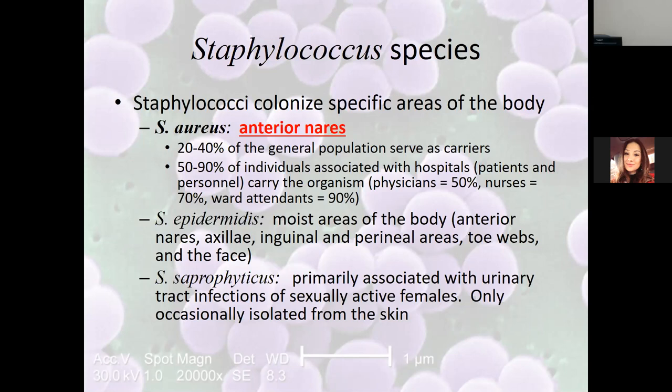Now they got you scared about your lab today. There is staph aureus in your lab today. Okay, it's not MRSA, I don't think. I think I brought out just regular staph aureus, but staph aureus is down there. So again, be cautious of how you're handling it, where you're touching, where it's going.